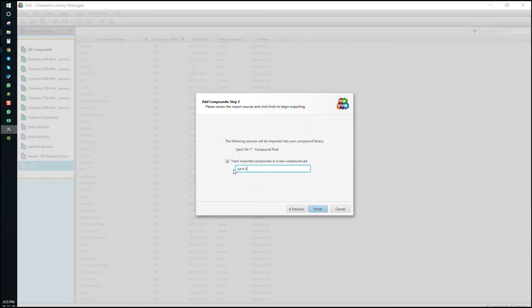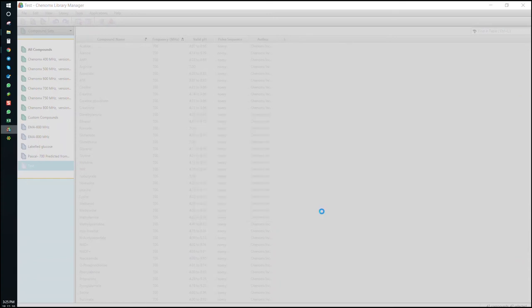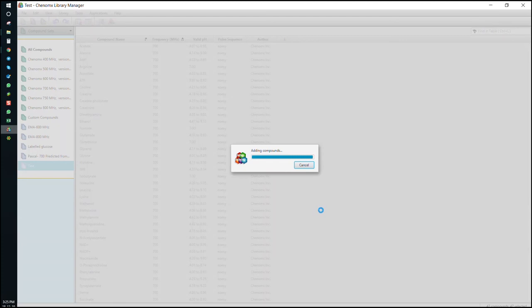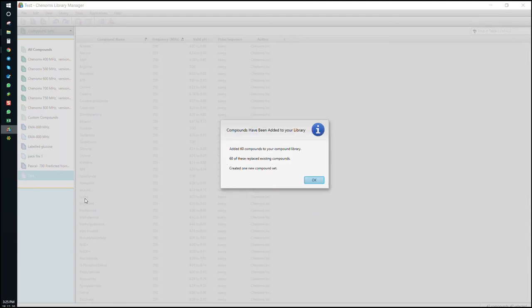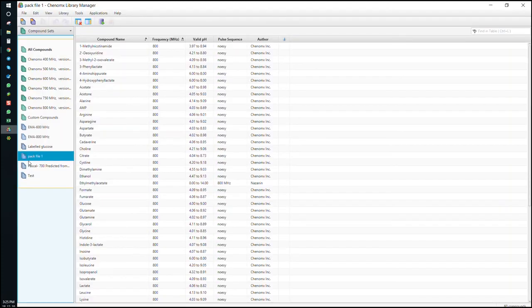Name it whatever you like. We'll say PAC file 1 and there we are. A new library identifying the signatures from the profiler module.